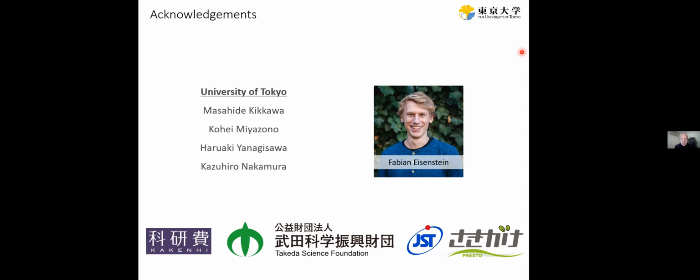So for samples that are challenging, so if you have something that you have to collect in thicker ice or something that you have to collect with tilt, really challenging samples, then these small factors probably won't affect the final outcome that much. These factors get important when you already have optimized the sample and you're lucky to have particles which are randomly oriented in the ice. So they won't rescue the sample. Of course, zero loss energy filtering is always a must, I would say, especially with thicker ice or tilted samples where you also increase the thickness of the sample. So yeah, hope that answers your question.